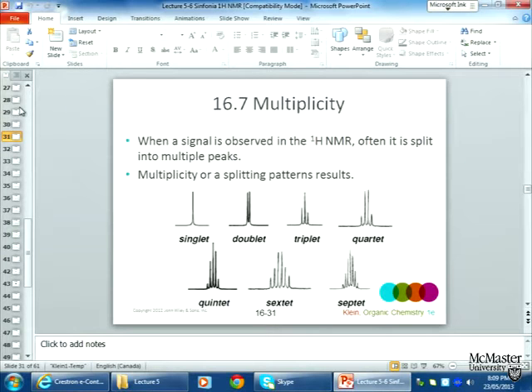Methylene groups, in many organic compounds, the 2 hydrogens in a methylene group are homotopic, same chemical shift. And so we see a signal that integrates for 2 hydrogens. So we can pretty much count the hydrogens out in a proton NMR. So we're learning a lot about molecular structure.